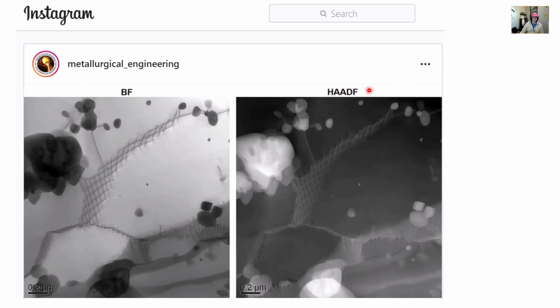And so, scanning transmission electron microscopy. We're not going to see a diffraction pattern here because the beam is rastering. It's a mode that we see on some SEMs, and some TEMs can have STEM mode as well. I should probably talk a little more about that at a later date. But you still have a bright field image and a dark field image even in STEM because the signal goes somewhere else. And if you look, dark field is pretty much the inverse of bright field.